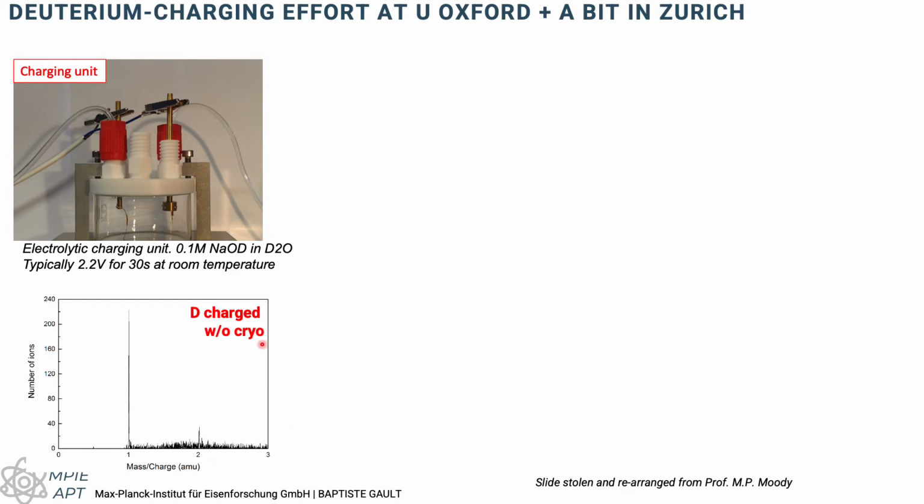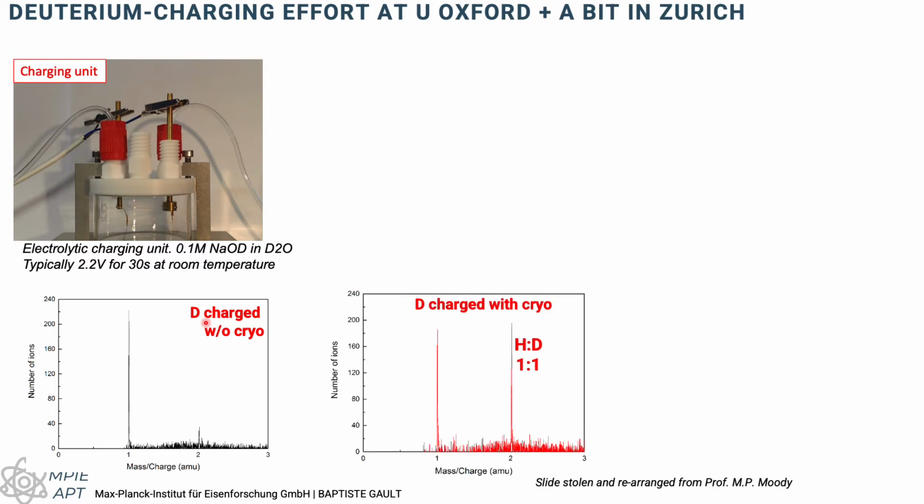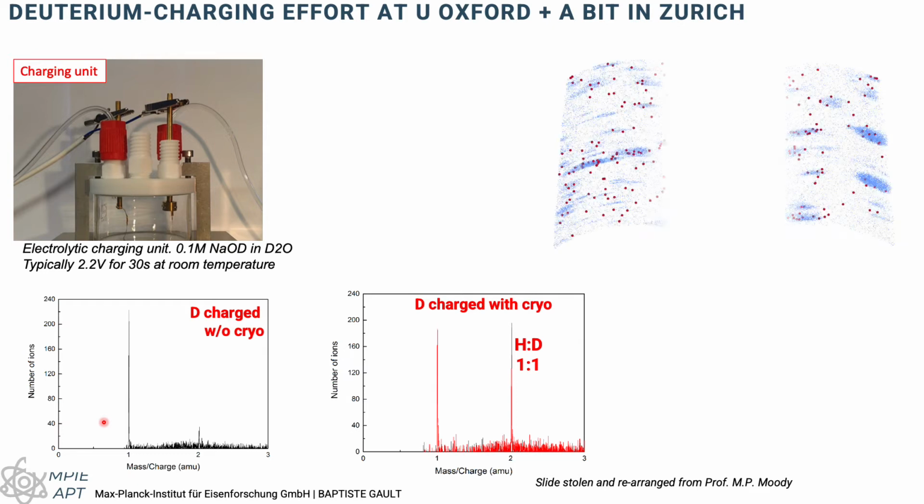But without the cryo vacuum transfer system, this mobile deuterium will probably migrate out of the needle before we can perform the analysis. If you do the same experiments on the same types of material with the cryo transfer system, you get to detect much more of the hydrogen or deuterium that you've introduced in the sample, which is exactly what you need to do. And this H signal will come from the chamber in parts and also from the specimen, which we will discuss a bit later.